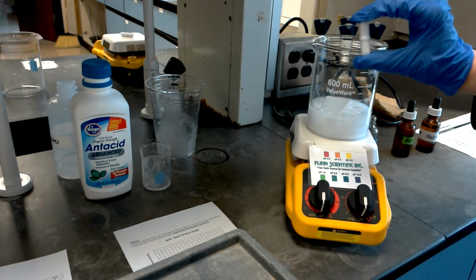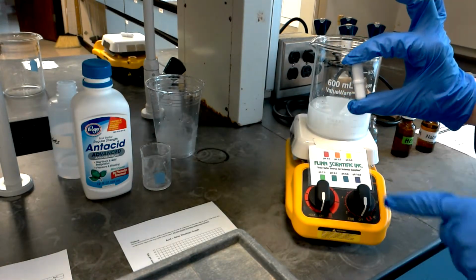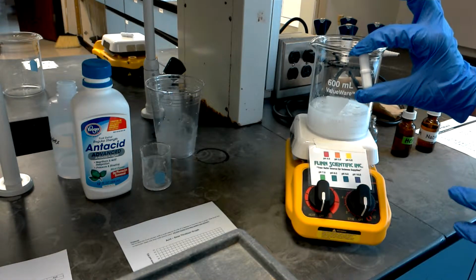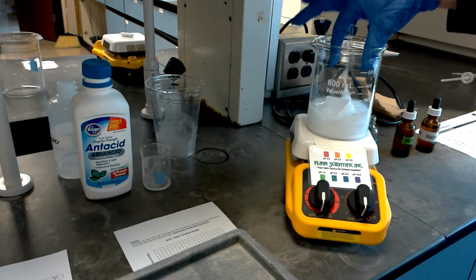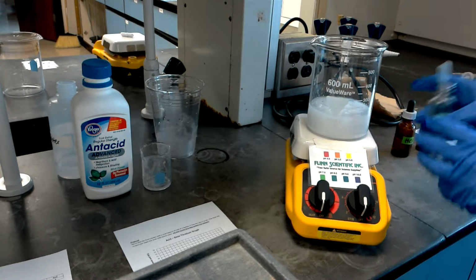Next, we're going to put in our magnetic stirring rod. Please remember not to flush this down the drain whenever the procedure is finished and you do your disposal, because you don't want to get rid of it. It's an expensive piece of labware, so you want to make sure you don't throw that away whenever you're disposing of it.